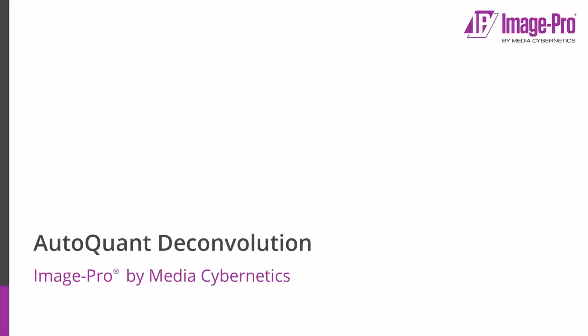In this short video, I'm going to discuss how we can use AutoQuant deconvolution for 2D and 3D datasets in Image Pro.